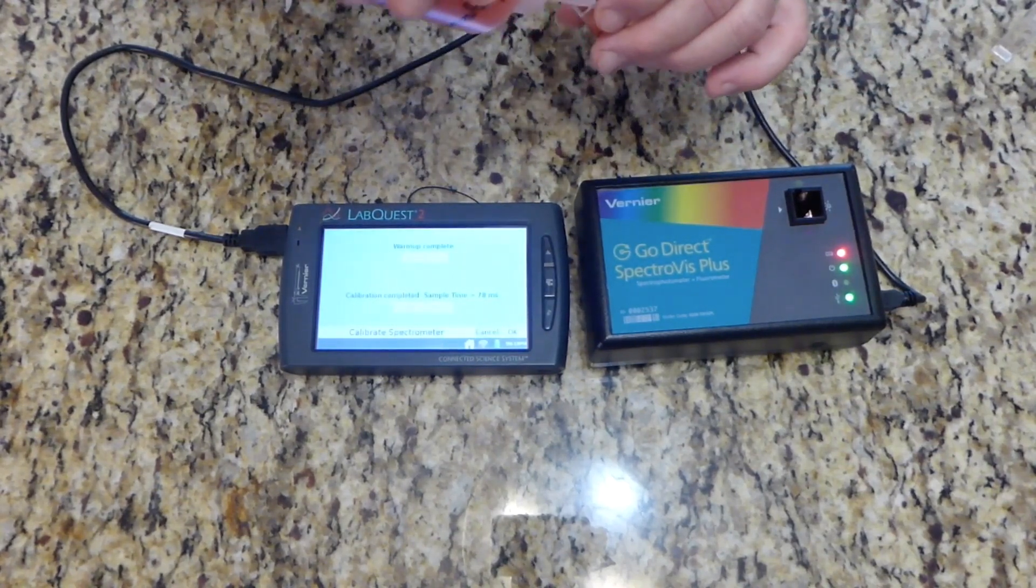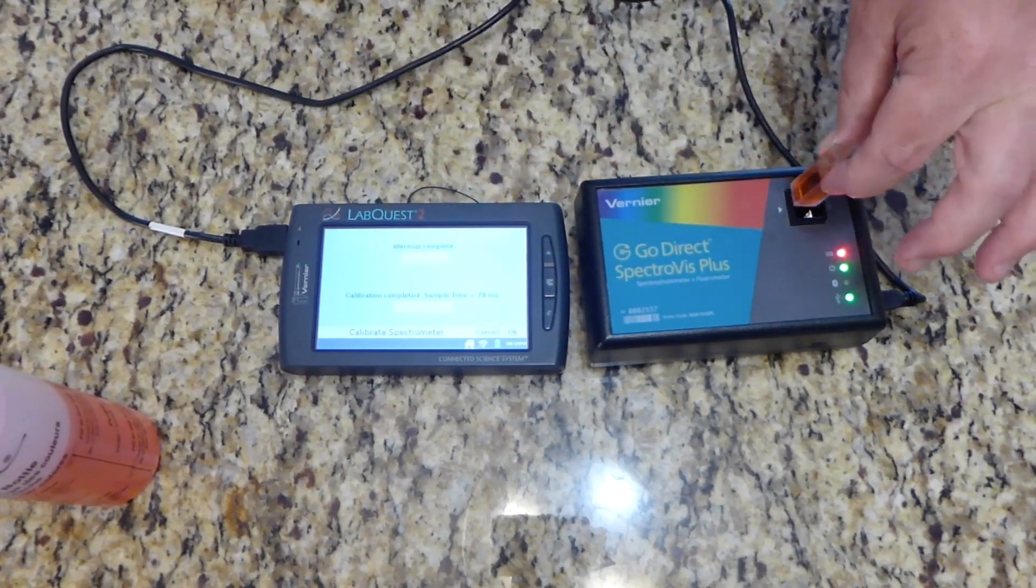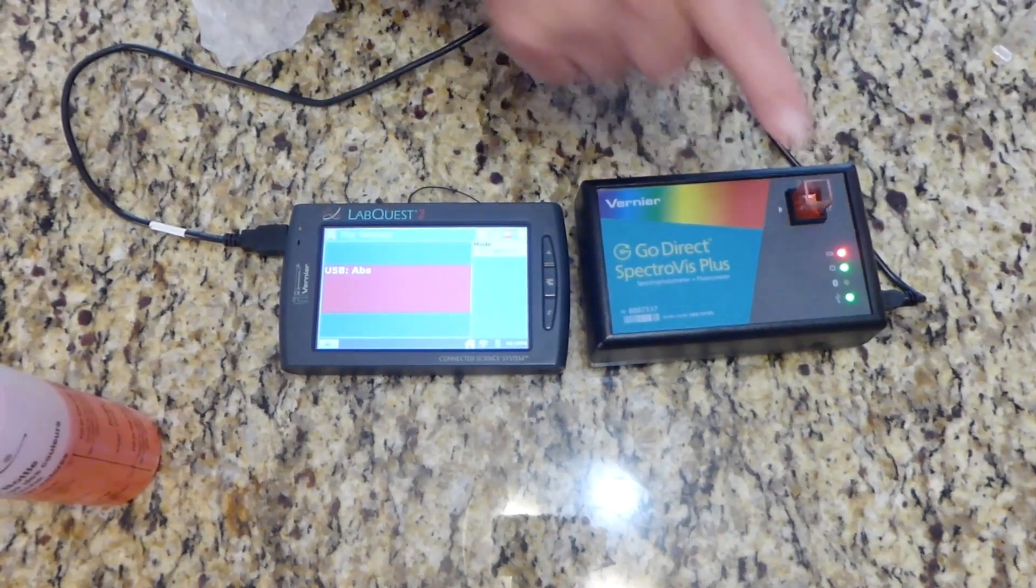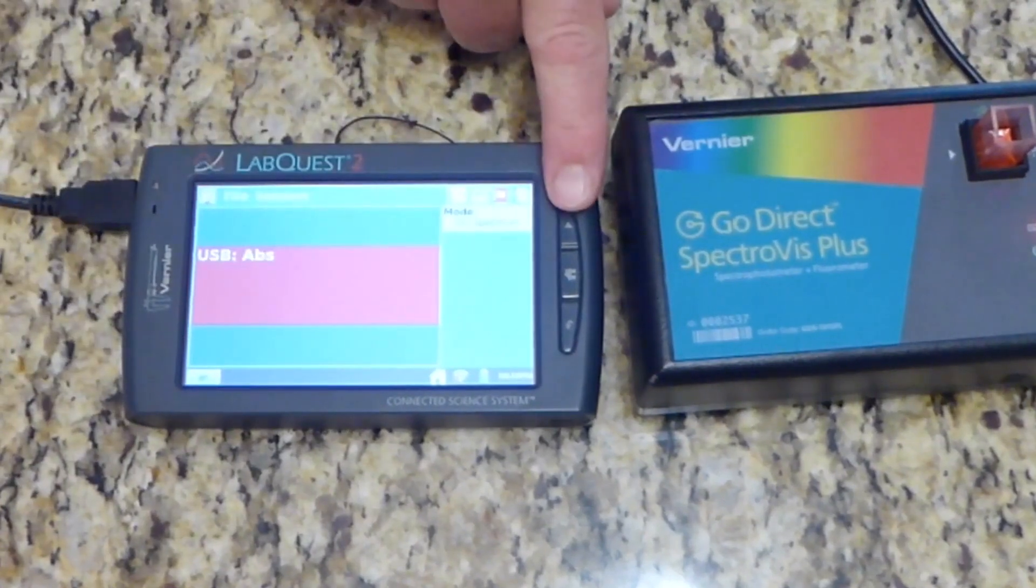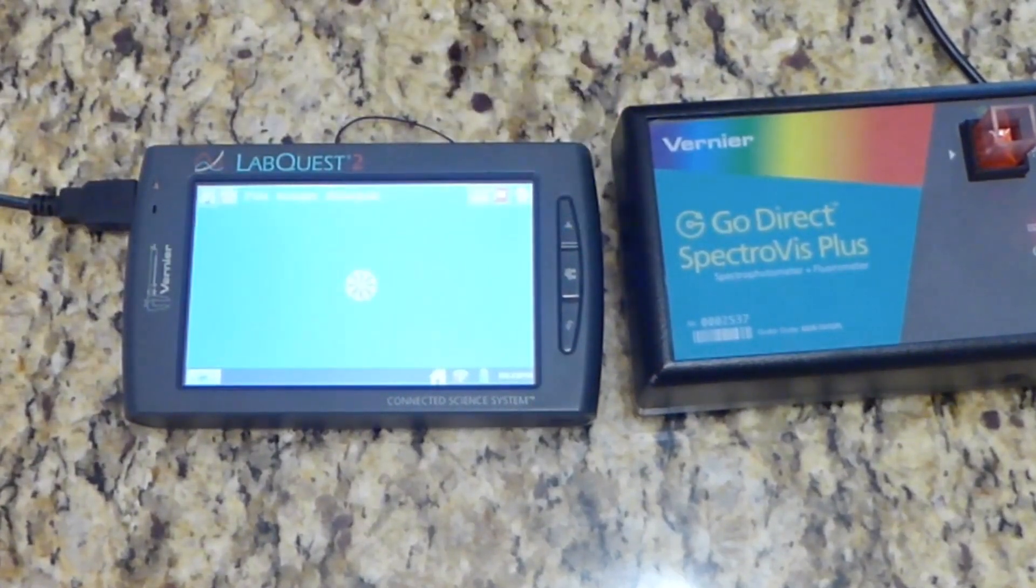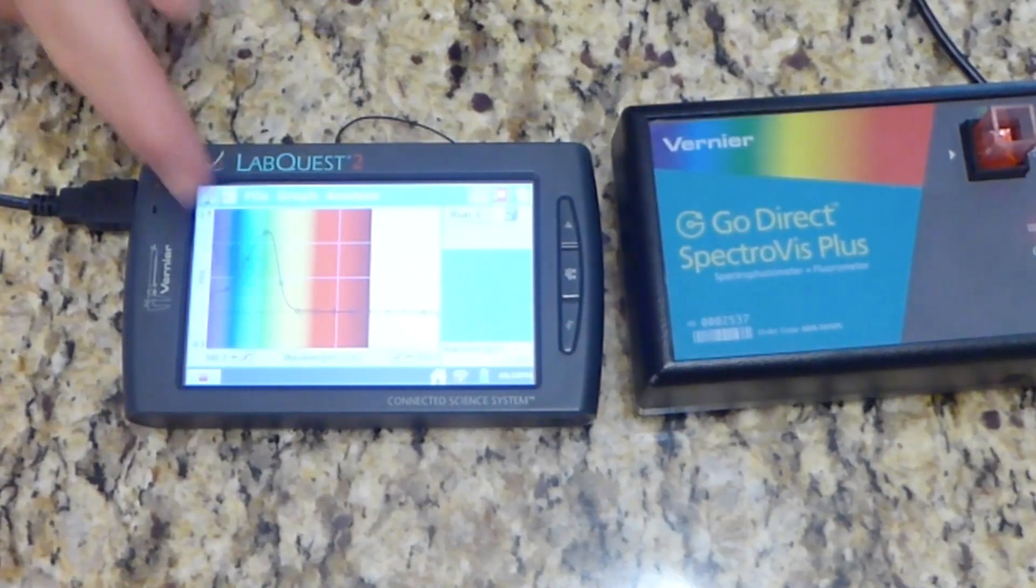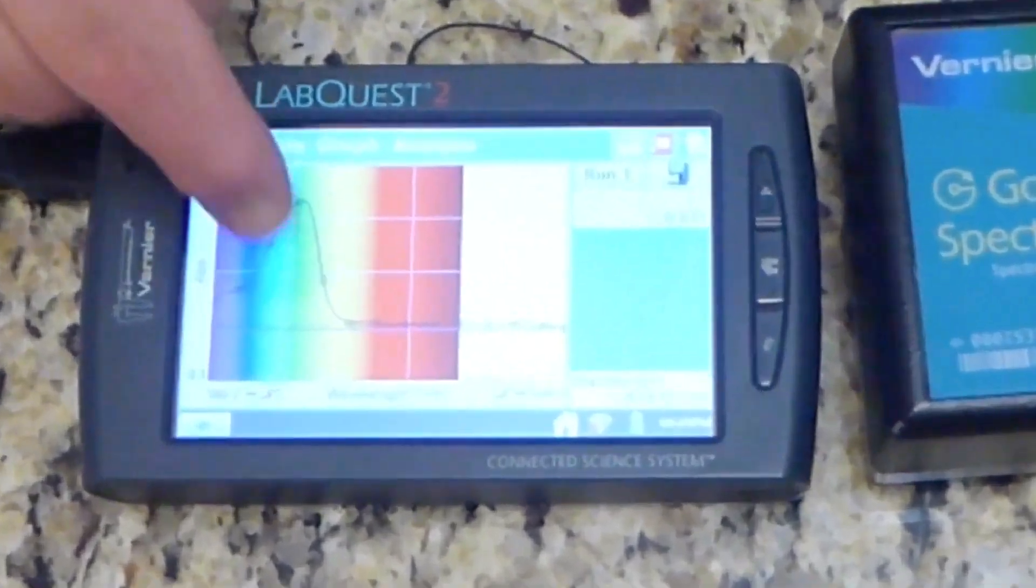Here's a red solution. I'm going to pour the red solution in the cuvette. I'm going to wipe it down and place it in. This one is different. You're going to have to put in the solution and then push the go button. Down at the bottom left, you push that button. And it's going to record all the different wavelengths at one time. As soon as the graph appears, then you can push the button again.